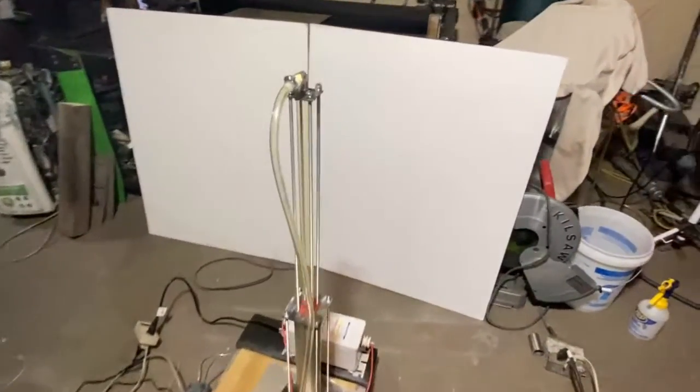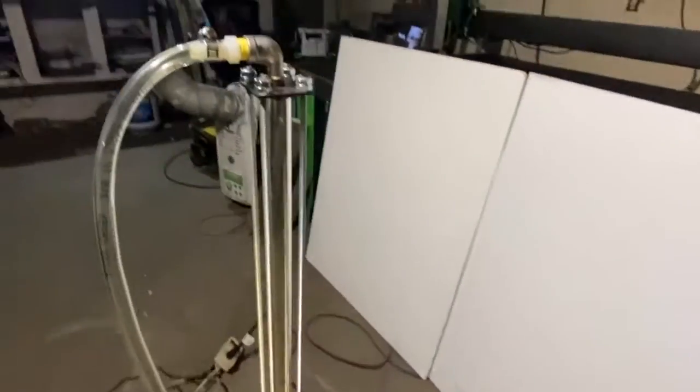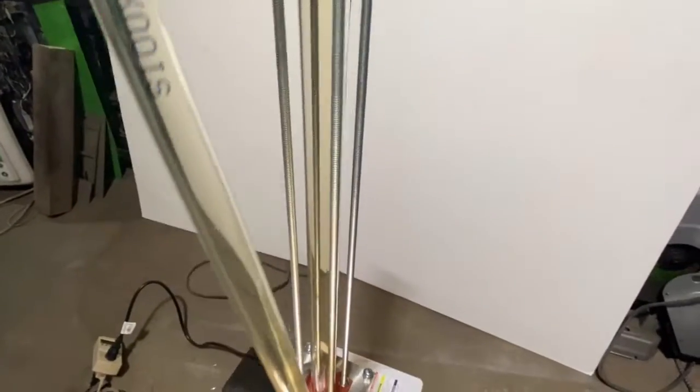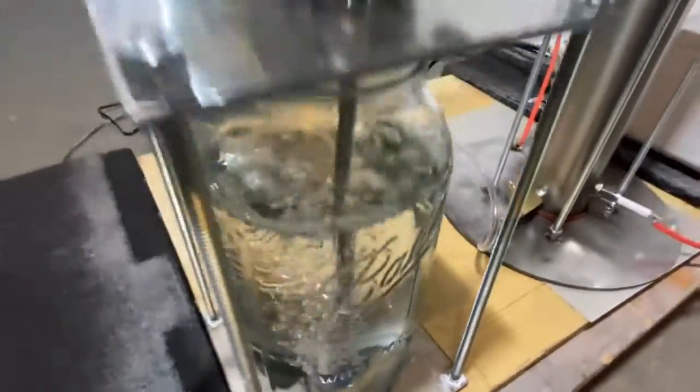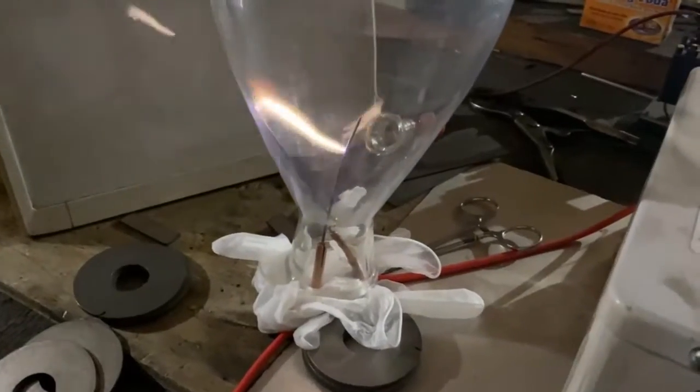What we're looking at right here is a Birkeland-Eyde reactor used to synthesize nitric acid from electricity and thin air. Last week, you saw me doing some electrode testing to determine what was going to be the most compatible configuration and metallurgy to make this a long-term process.